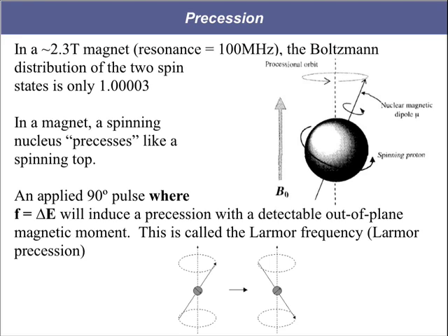I want to talk very briefly about something called precession before I cut to a YouTube video that explains it a lot better than I could. Precession you can imagine as what happens to a spinning top when you exert a force on it from 90 degrees off its axis. Imagine that you've got a spinning top and the top is spinning perfectly on your desk. It's going to be aligned vertically, which is essentially in line with the Earth's gravitational field. As that top is spinning, if you flick the top from a 90-degree angle, so from the side horizontally, that top is going to wobble as long as you don't knock over the top. The top is going to wobble as it spins. That wobble is called precession.